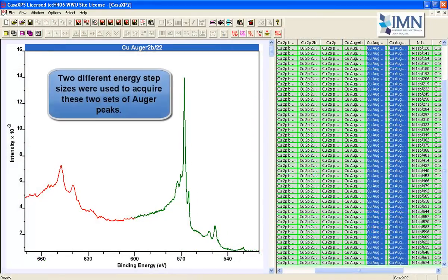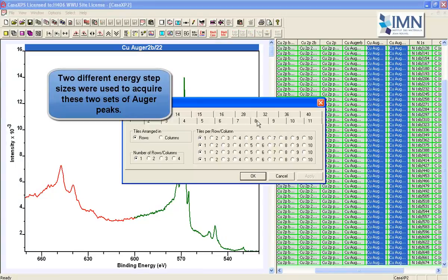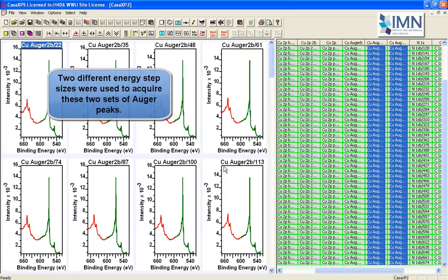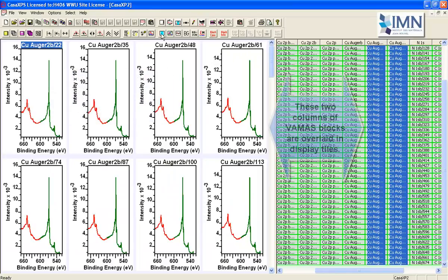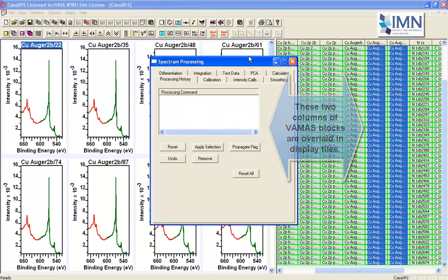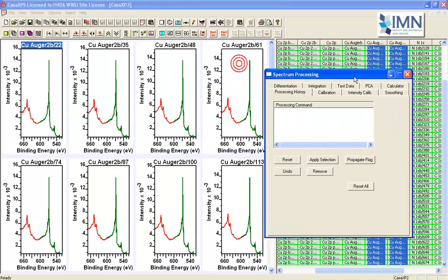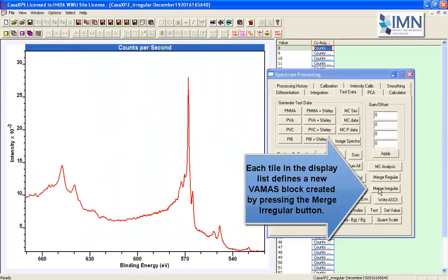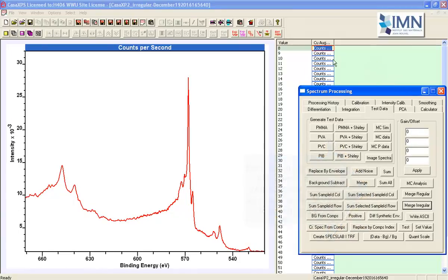We've got data that allows us to interrogate the changes in this material using Auger lines. We've also got valence band and a range of other measurements, but we're going to focus on the Auger lines right now.